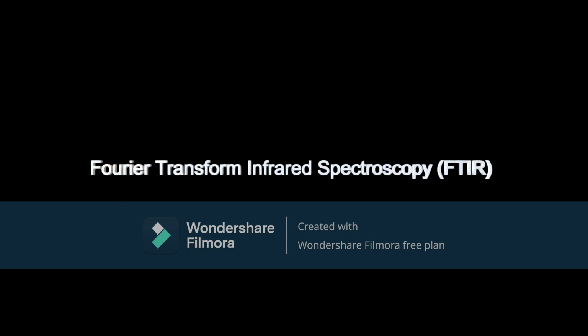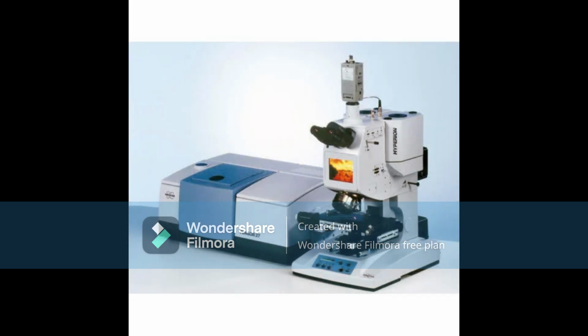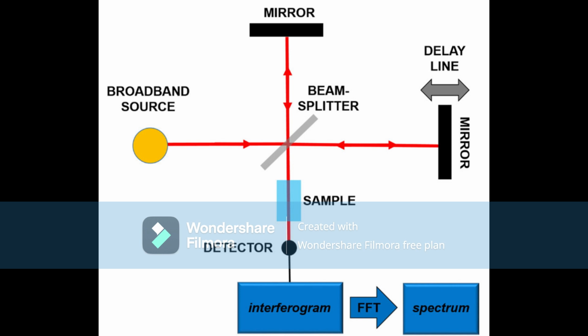Section 2: Fourier Transform Infrared Spectroscopy FTIR. What is FTIR? FTIR stands for Fourier Transform Infrared, the preferred method of infrared spectroscopy. In infrared spectroscopy, IR radiation is passed through a sample. Some of the infrared radiation is absorbed by the sample and some of it is passed through.